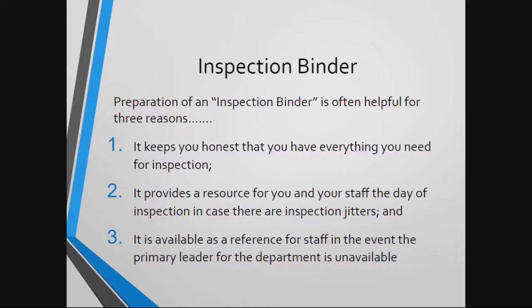The inspection binder, if you will, is a copy of the histology and cytology checklist, one in its own binder, with each standard occupying its own page. And then behind each standard, I place all evidence of compliance, including the appropriate policies and procedures and/or examples. As I mentioned earlier, I have completely converted this to an electronic format, so it is pretty easy to manage, but either way it serves the same purpose, whether it's electronic or, if you don't have an electronic means of doing this, you do it in a binder.